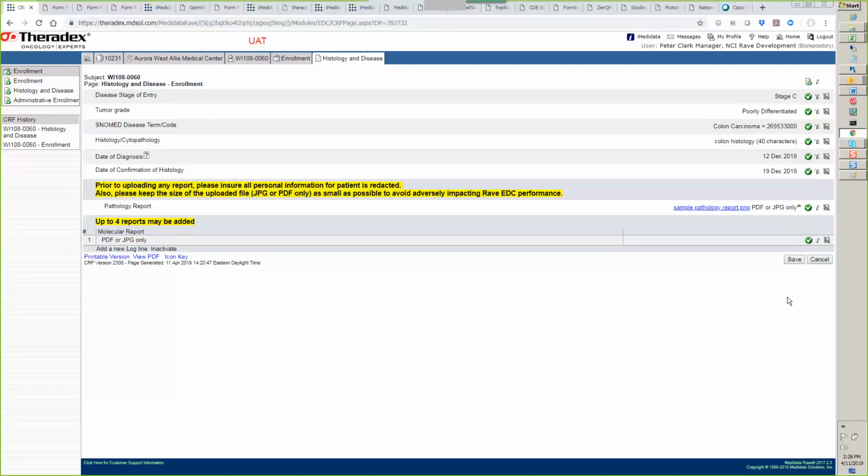Okay. Yeah, because we've had rare instances, but we've had some instances before where we needed amended pathology reports or information that hadn't come in the original one to be appended to it. But if that's something that Diana would be the one responsible for, then I think the answer to the question is probably none of us should have access to that edit function.